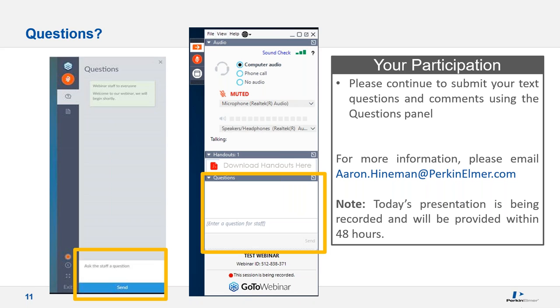I had a question. That's a good question. What is J value? The J value is something that's put forward by US Pharmacopeia in USP methods 232, 233. It deals with the concentration. It's a way to determine the concentration of your analytes for a particular pharmaceutical or drug product.